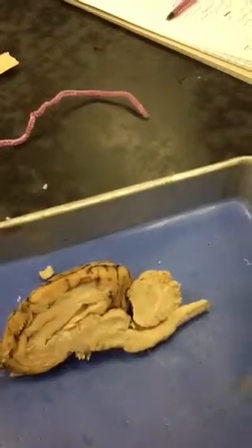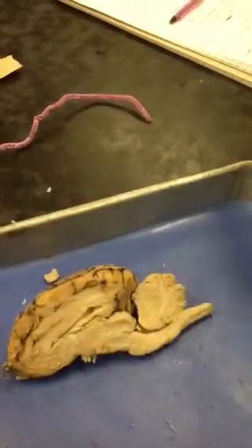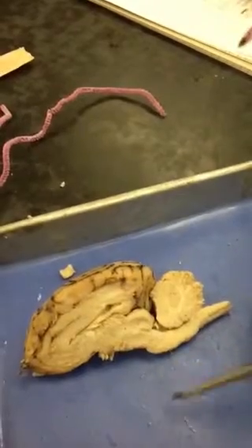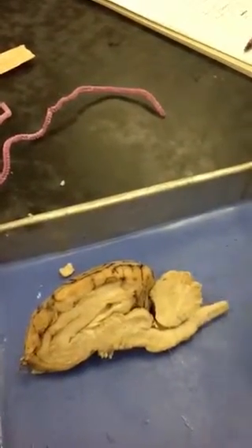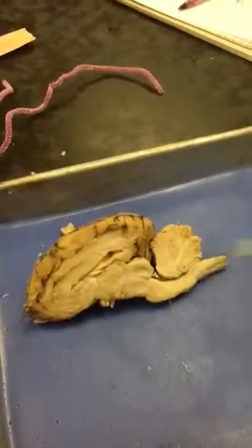Okay, and next we have the corpus callosum. This is right here. This is the structure that connects the two lobes of the brain, so they communicate with each other. It's composed of all white matter. Composed of all white matter, and what was that? Commissural fibers? It uses commissural fibers. Yeah.